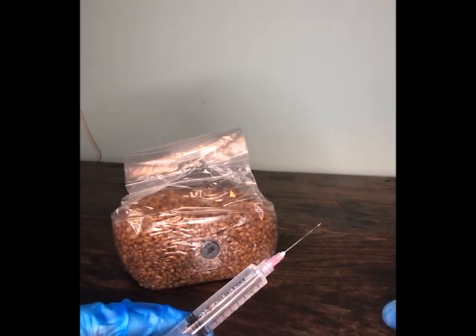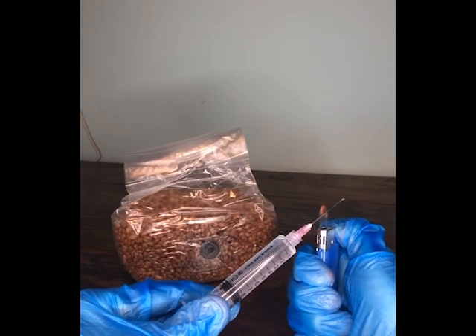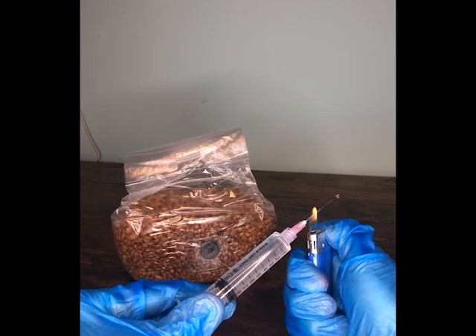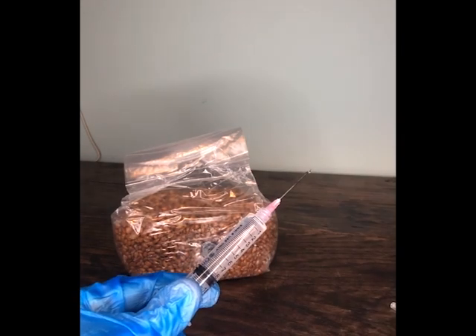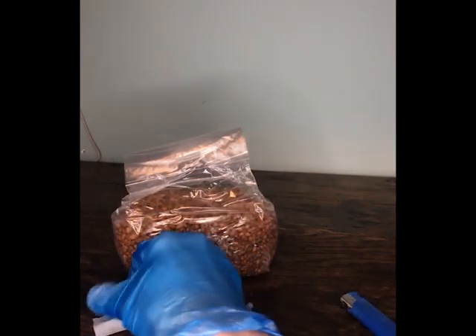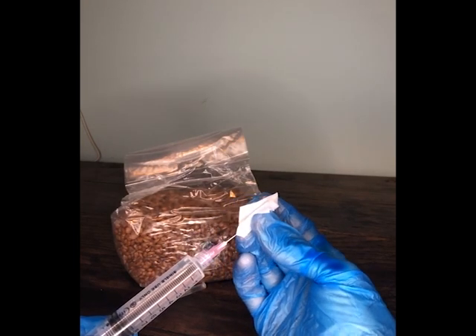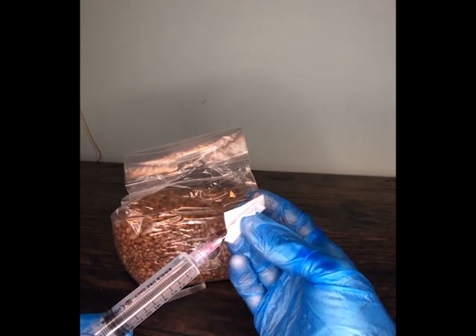Next we're going to remove the cap from the needle and flame sterilize the needle. Once we've managed to get the needle to glow all the way along from getting it hot enough, we're then going to put the needle into the alcohol swab. This is to cool the needle down to make sure it's not too hot, otherwise it will kill the mycelium as it comes through in the liquid culture.